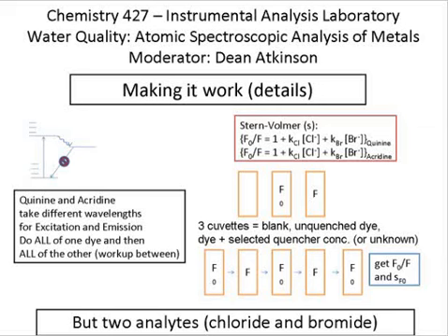So words to the wise, work up your data as you go along, make sure the data makes sense as each data point is derived. Make sure the data in aggregate makes sense before you walk out the door, because this is a hard enough lab to write up when the data looks good. It's next to impossible to write up when the data looks bad.